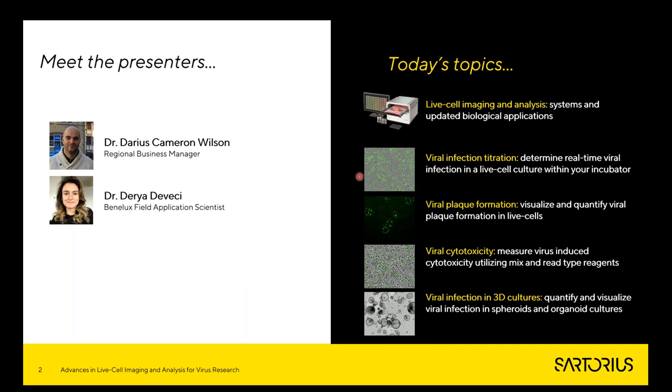She'll start off with a brief introduction on what is live cell imaging and analysis, so essentially an overview of the systems and the biological applications, before really diving into some research-generated data from across Europe on viral infection titration, viral plaque formation, viral cytotoxicity, and viral infection in 3D cultures.